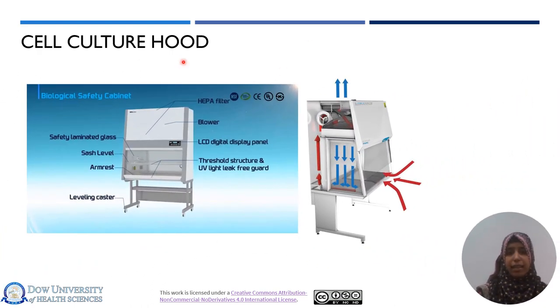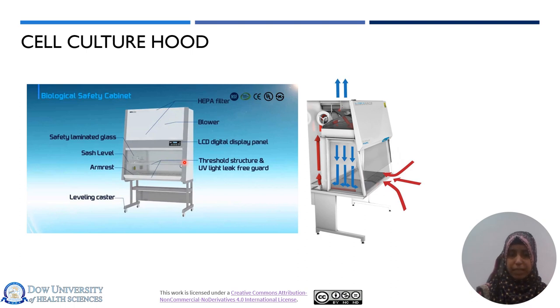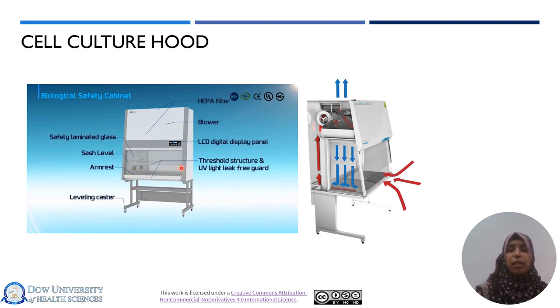This is a pictorial representation of a basic cell culture hood. It includes a HEPA filter at the top, a section with a blower and laminated glass, and the sash of the biological safety cabinet. There is a particular level up to which you can raise the sash; raising it further will cause beeping because it disturbs the airflow and creates contamination problems. There is also an LCD digital display panel showing all settings, including airflow velocity, and a leveling caster with wheels for easy repositioning.